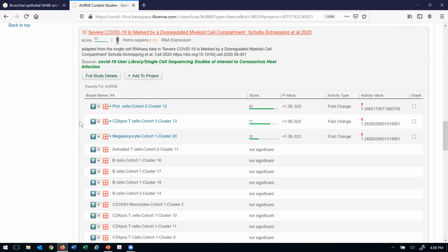I'd like to end here, as I could run on forever. I did not get to show off the work I'm doing with my wisdom of crowd collaborators, generating SARS-CoV-1 mouse lung infected temporal metasignatures. Suffice it to say, the correlations and extensions to the human SARS-CoV-2 infection studies at bulk and single cell RNA expression levels are astounding. I'd be happy to meet again to discuss that with you.